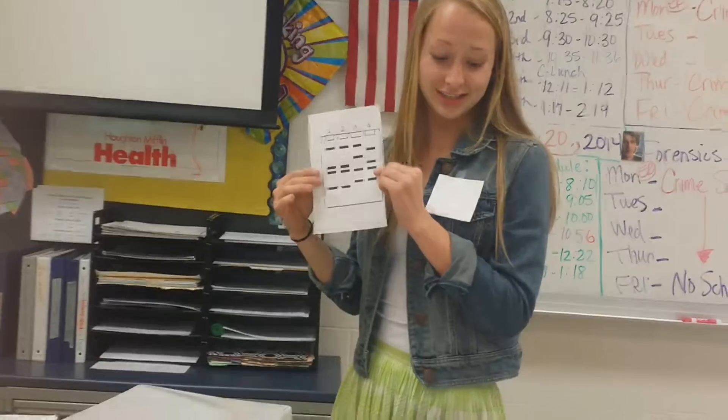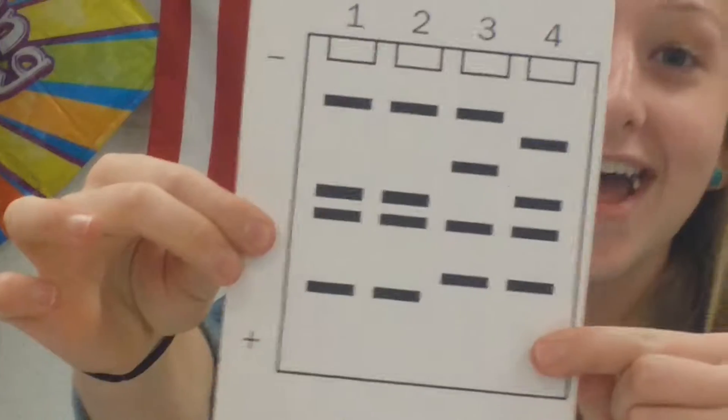The electric current causes the negatively charged DNA bases to move through the gel towards the positive bottom. If the sequence of the bands are the same, the DNA is a match.